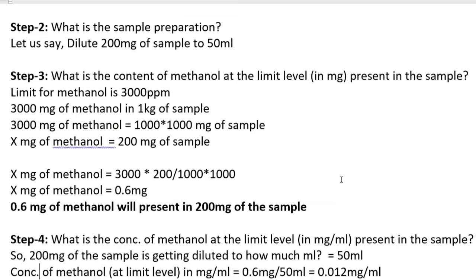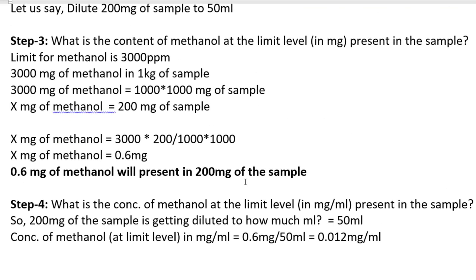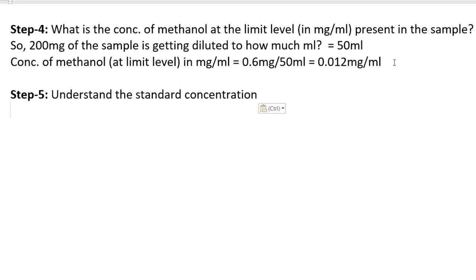We got the concentration of methanol in mg per ml. What is step number 5? Step number 5 says understand the standard concentration. This is a very crucial step, and let me paste it over here. Understand the standard concentration.